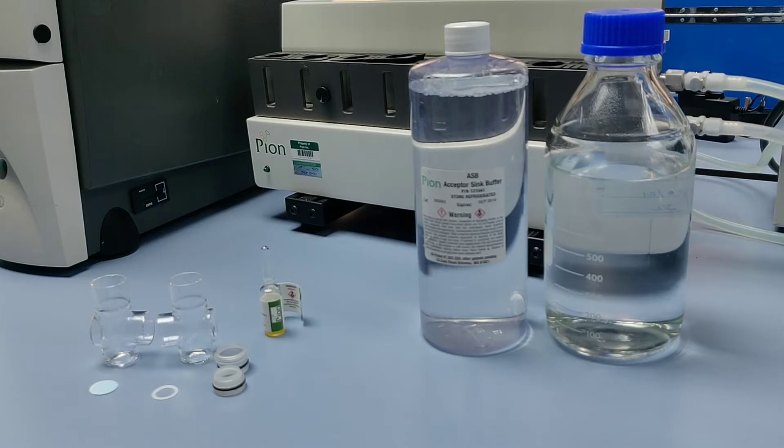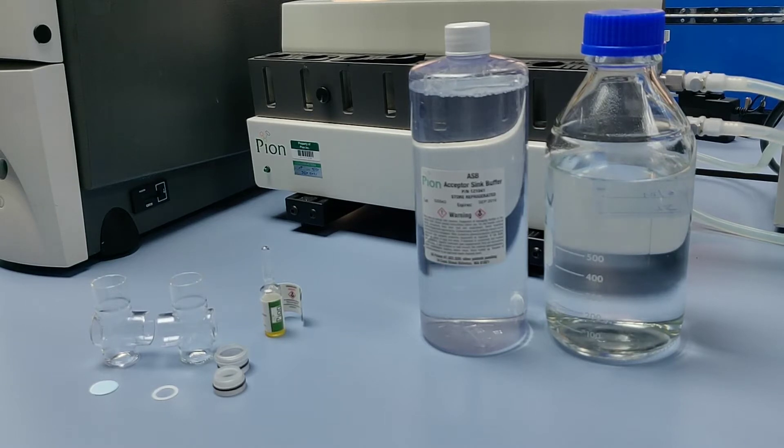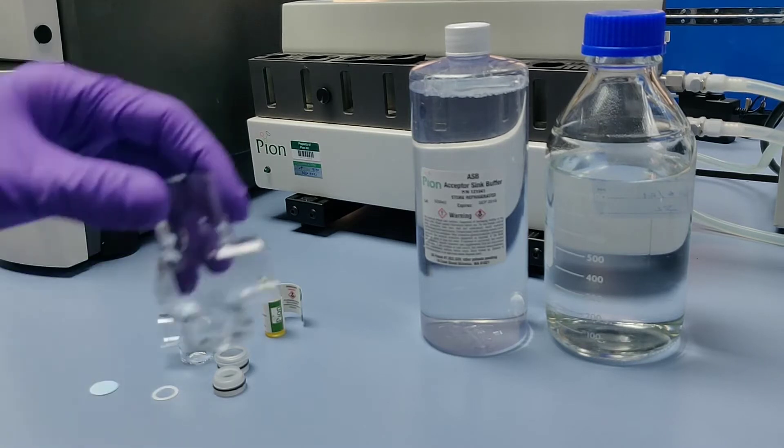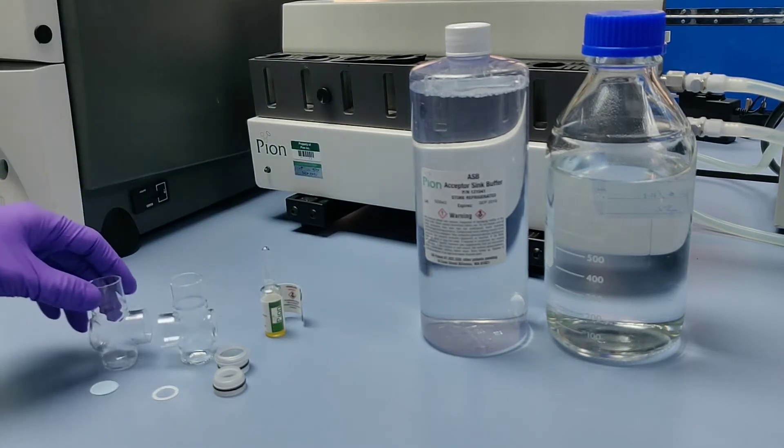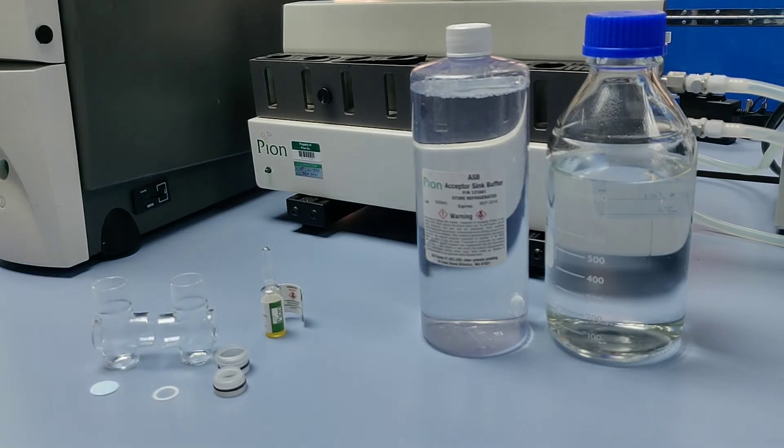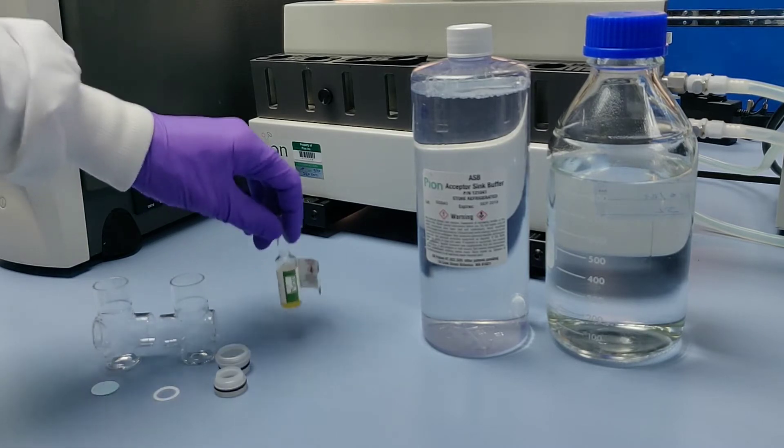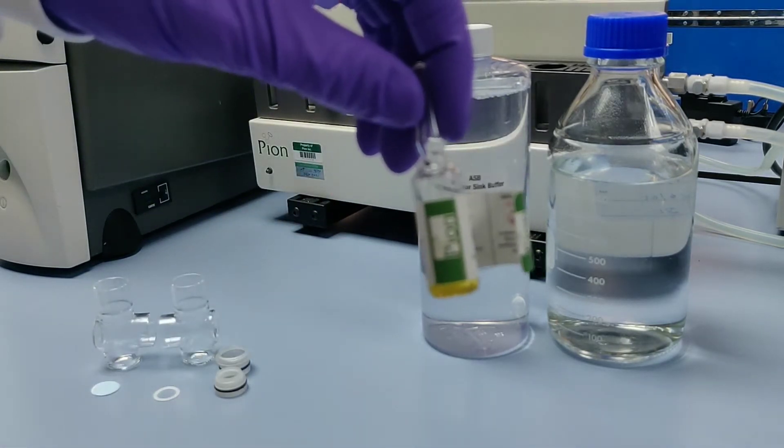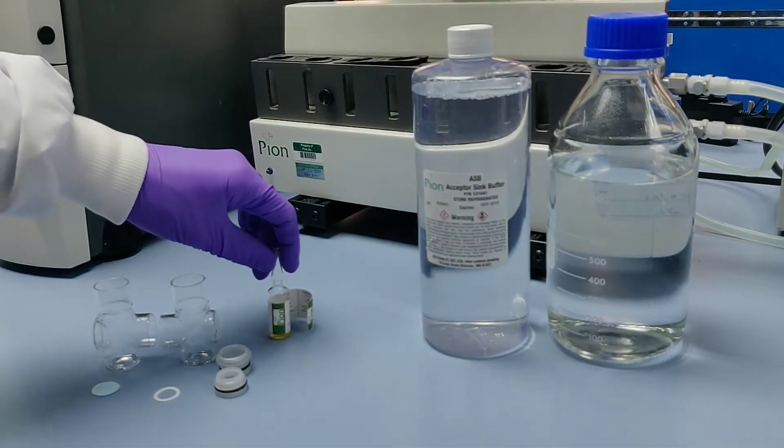To assemble the flux pairs, we will need four separate components: the glass chambers themselves, a PVDF membrane support, a membrane holder made up of female and male parts, and a Teflon washer. We will also need to have on hand GIT lipid solution for coating the membrane, and our media for our donor and acceptor chambers.